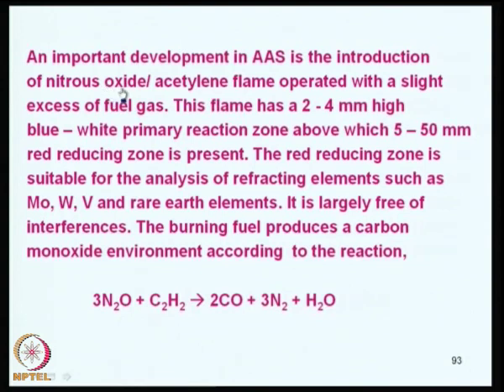Now, another important development in atomic absorption, occurring almost at the same time, around the 1960s, is the introduction of the nitrous oxide and acetylene flame operated with a slight excess of fuel gas. This flame has a height of about 2 to 4 millimeter.